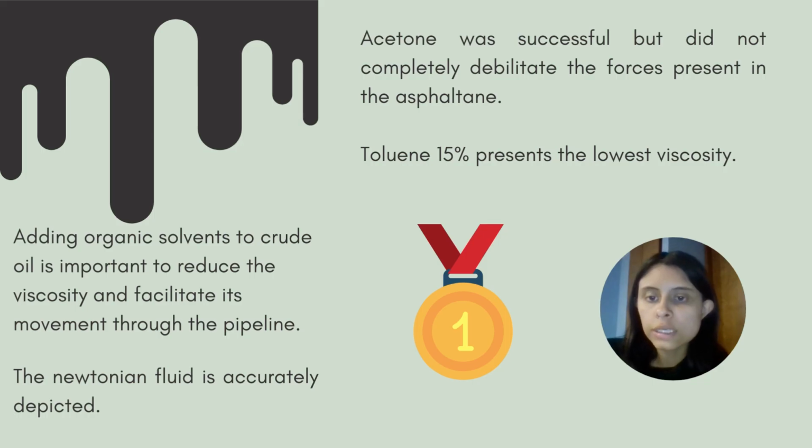In conclusion, it is evident that adding organic solvents to crude oil is extremely important in industrial terms. This is because it helps to reduce the viscosity, and because of this the product can be transported and its movement can be facilitated through a pipeline. Additionally, it was seen how the crude oil and its mixture with solvents had the behavior of a Newtonian fluid.